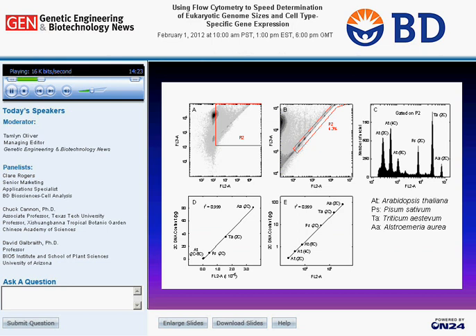Now, the positions of all these peaks indicate the amount of DNA that's present, and we also know the amount of DNA that's present from the C-value database at Kew. And so panel E then allows you to plot the fluorescence that we measured against the known DNA content. As you can see, it has an extremely high level of correlation.